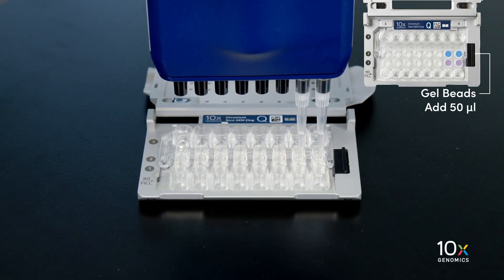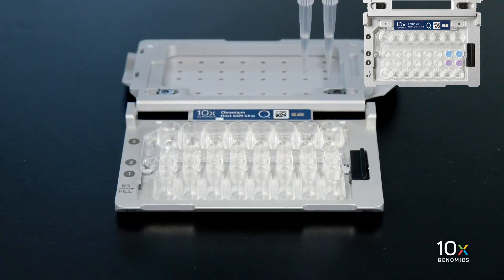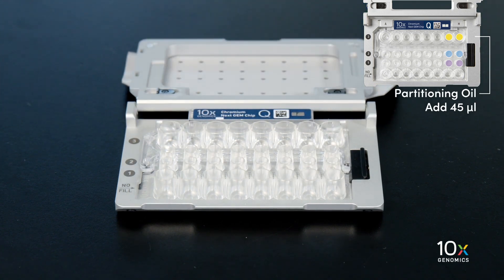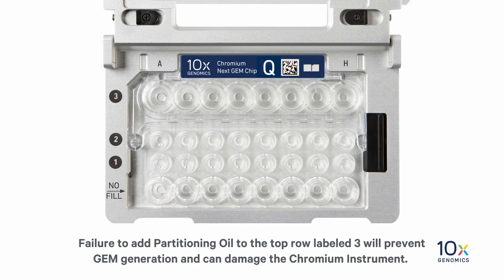Wait 60 seconds. Finally, add 45 microliters of partitioning oil into the wells in the row labeled 3 from a reagent reservoir. Failure to add partitioning oil to the top row labeled 3 will prevent GEM generation and can damage the Chromium instrument.